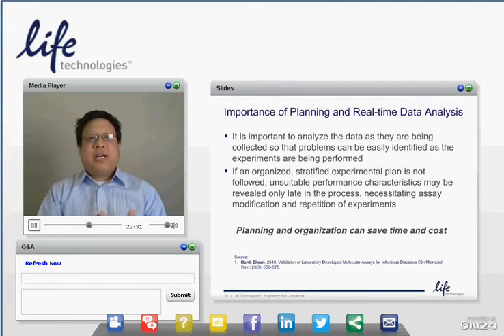So a lab director can only approve the protocol. A supervisor can design the study. An operator can run and input data into the software. This allows laboratories to control and protect their data from any accidental changes or anything.